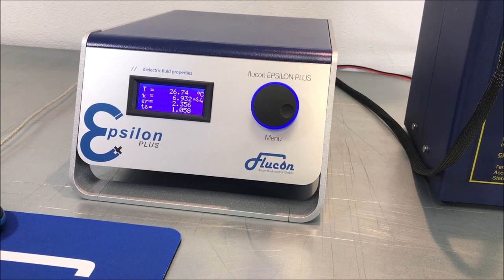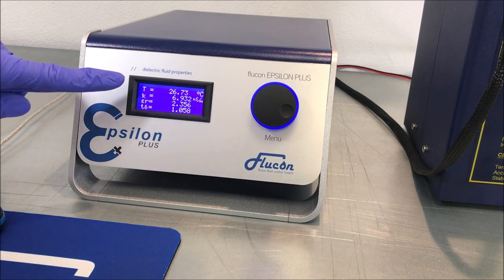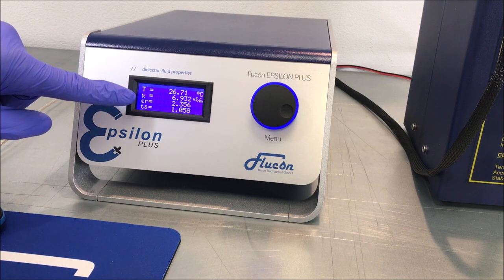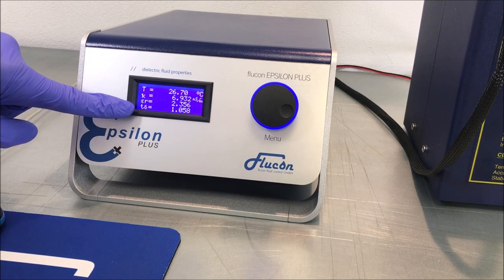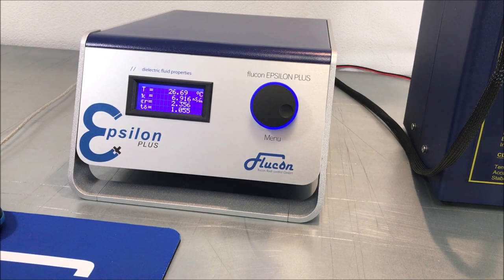After approximately one minute, the first measurement values will be displayed on the LCD of your Epsilon Plus meter, including temperature, electrical conductivity, permittivity, and the DDF. You are now ready to use the Flucon software for automatic measurements and sample temperature control.